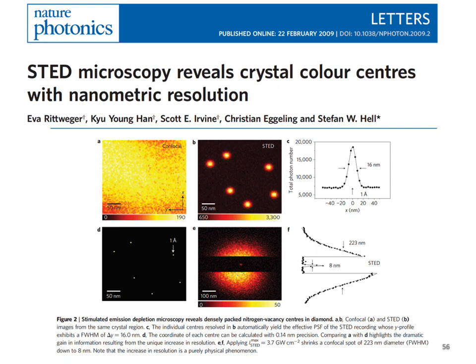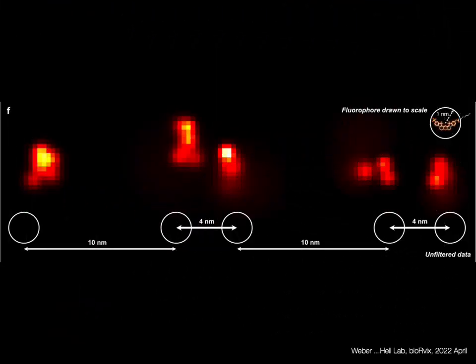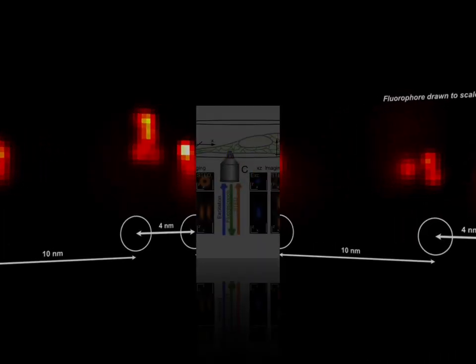But now, I have to tell you, I'm not sure if you know already about this, that at the end of April, in bioRxiv, there was this paper by Stefan Hell and his lab, where they demonstrated that using a variation on the theme of STED, and using the donut beam and using a trick related to photoactivation and following what's going on with single molecules, they are able to get a resolution of 1 nanometer and a precision of localization down to 1 angstrom. What about the cell?